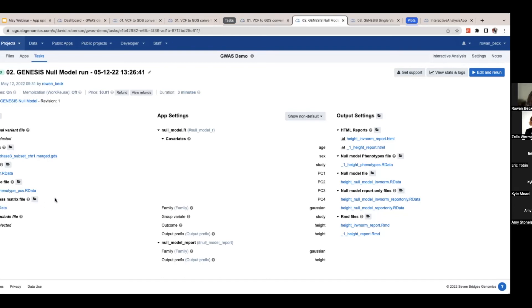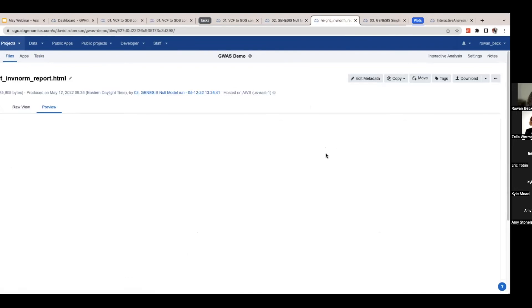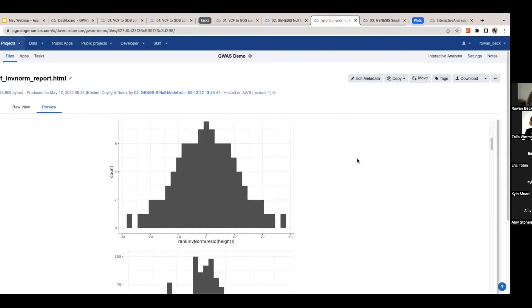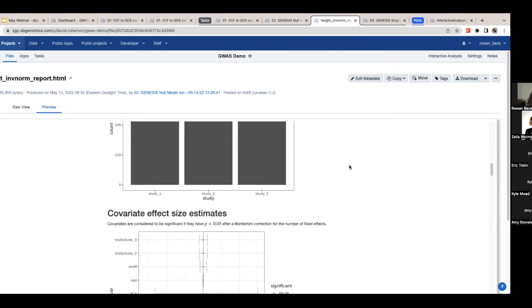You'll use the GDS file from the previous step and add in some additional information like ancestry information — found in the PC files and kinship data, all provided by our collaborators at the University of Washington. You can add certain covariates that you know might affect the model, such as age, sex, the study, and the various principal components. Once you click Run it takes just a few minutes, and you'll get several different outputs, many of which are HTML reports you can click and view right in your browser. This is an HTML report about our simulated phenotype, which is height in this case.